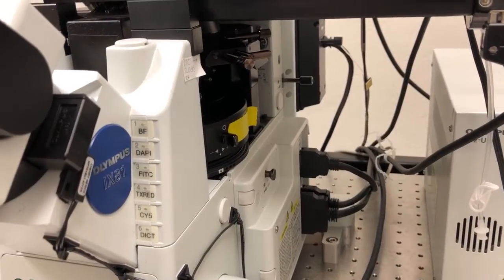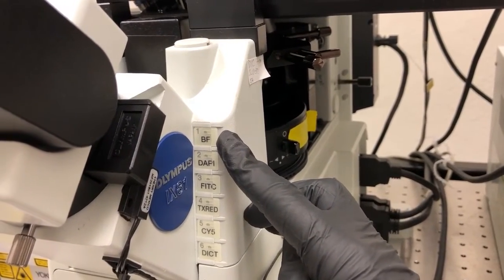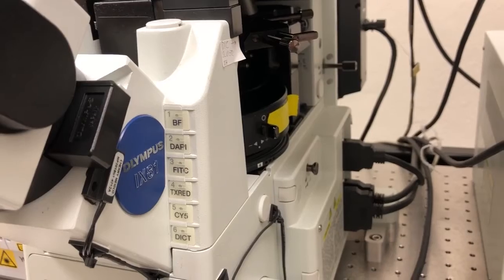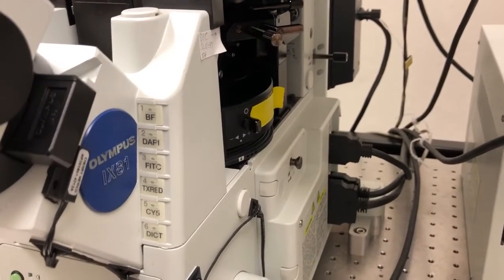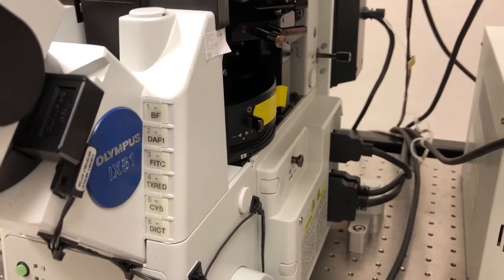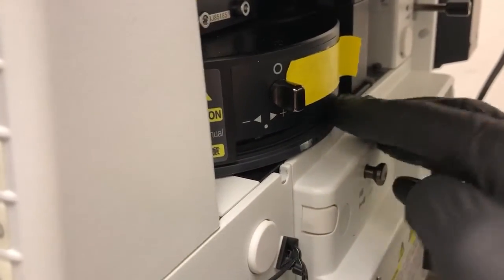The next thing we need to do is to make sure that the turret position is in number one. That's the same position as the bright field, and the reason for that is that position number one is an empty position, which allows the lasers to get into the sample without any problem. So right now, it is not on position number one. So I'm going to rotate this and put it in position one.